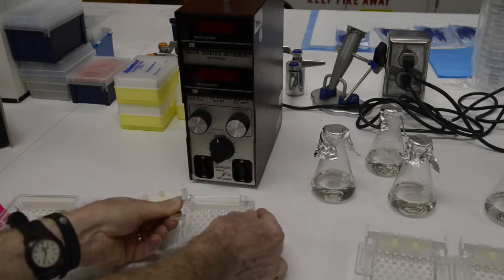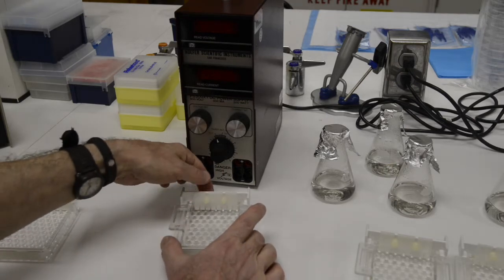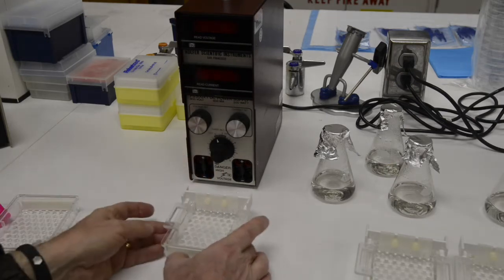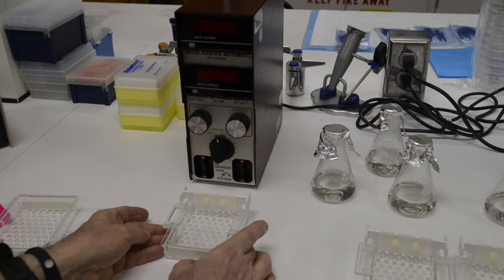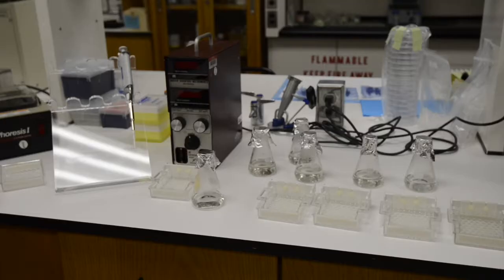So you're going to assemble a casting tray as I'm showing here. An eight-well comb goes into that casting tray and then you'll be preparing a 1% agarose solution to actually cast the gel.